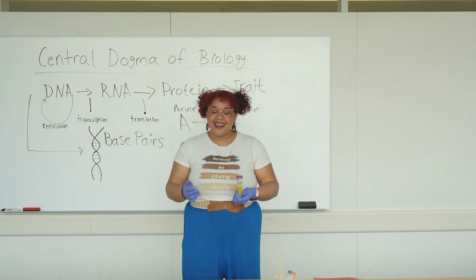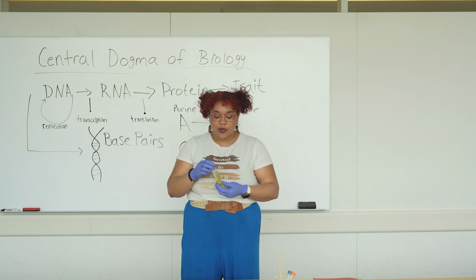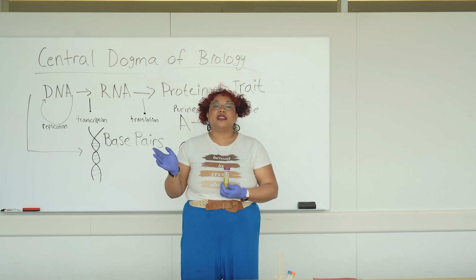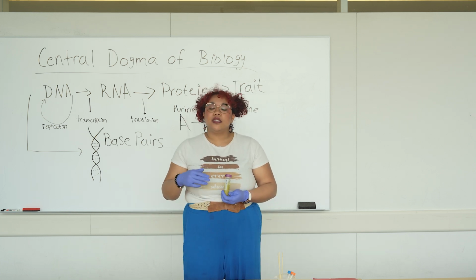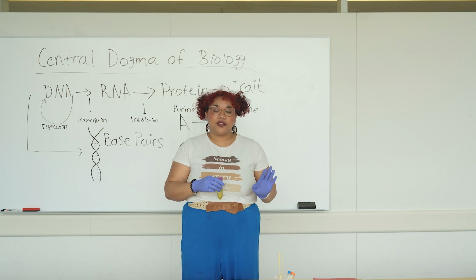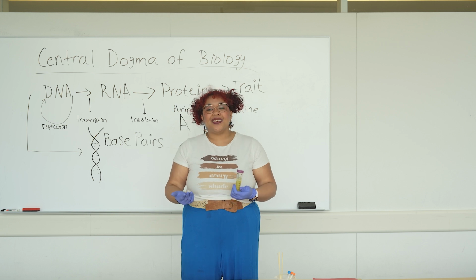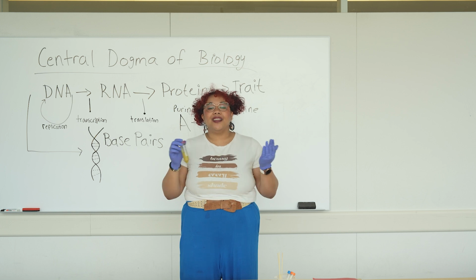So today we get to learn about the idea of DNA, and we got to walk through how to actually extract it for yourself, and going over a quick walkthrough of how the base pair rule works in terms of how the DNA helix is made. And the sheets that you have access to, there are other two activities that go over replication and how DNA is actually transcribed and then translated into protein that you can read in further details inside of your notebooks. But I hope that this was a helpful instruction for you that you can share with your students and have a shared joy in the beautiful thing that makes up all of us, which is DNA.